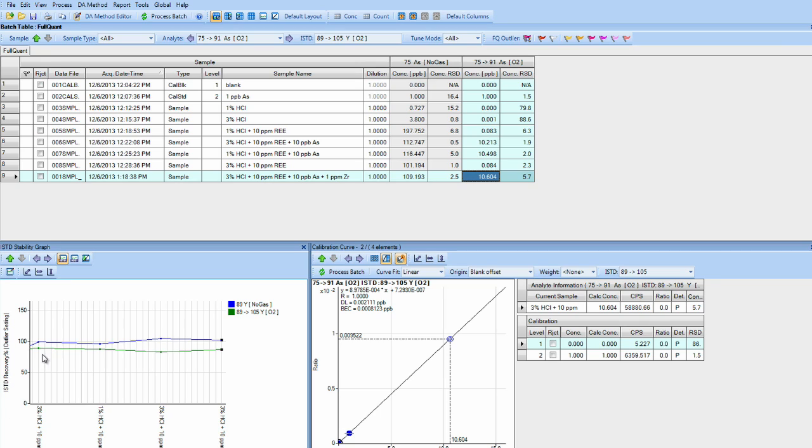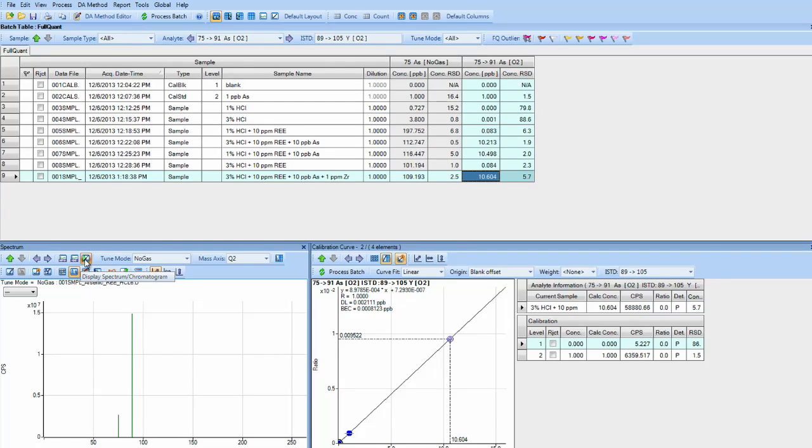So our analysis has completed and everything populates into the MassHunter data analysis window. We have our internal standard graph. We also have options to look at QCs if you have done them, or you can go into spectrum mode to view your spectrum real time.